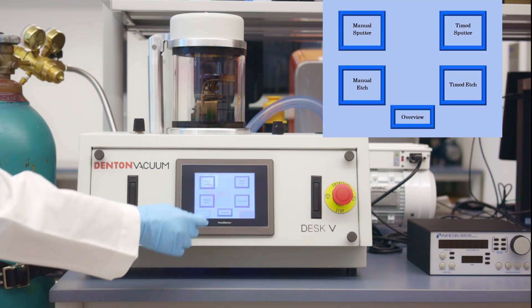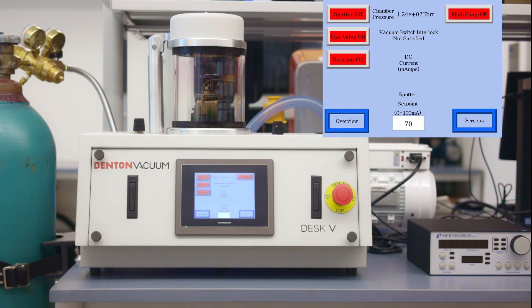Next, tap on screens, choose manual sputter. Tap on mechanical pump off. We will hear the vacuum pump running and the pressure in the chamber dropping.